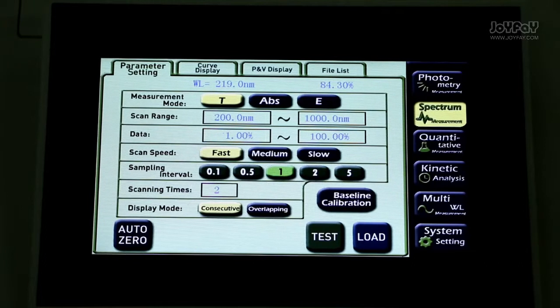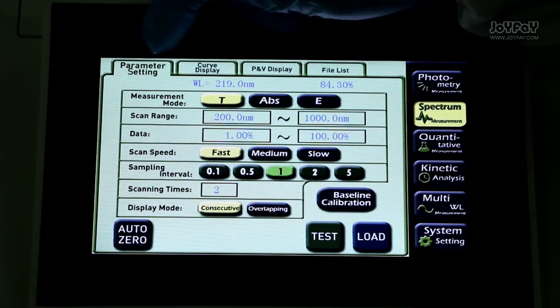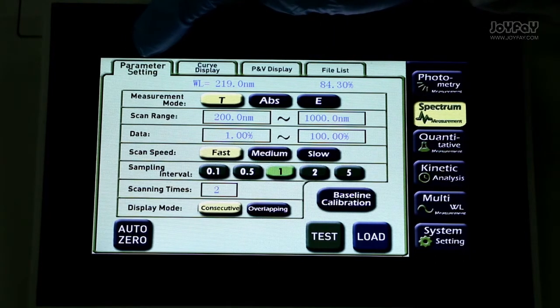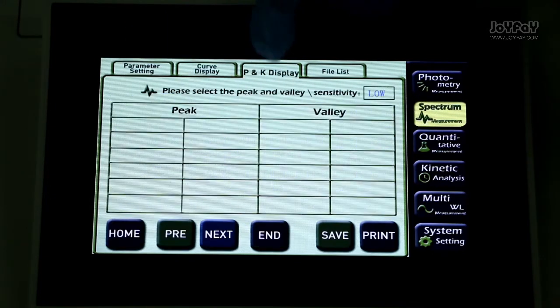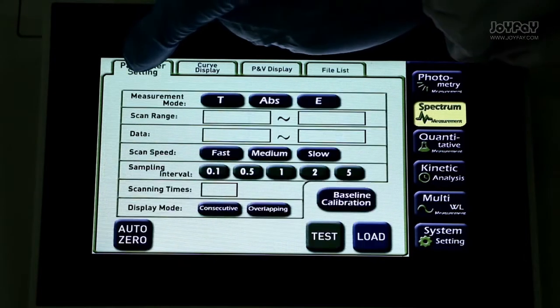By pressing spectrum measurement button, move to the second measurement. You can see the functions are much more complex than the first one. There are four tags: parameter setting, curve display, P and V display, and file list.